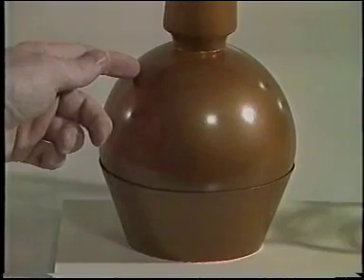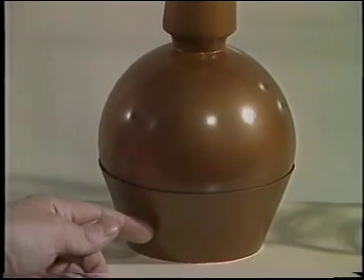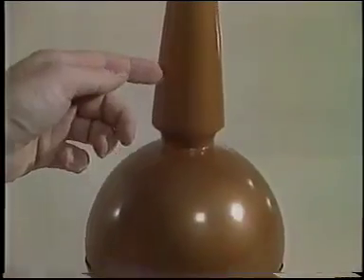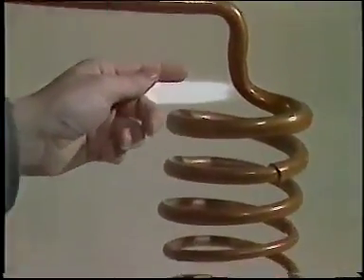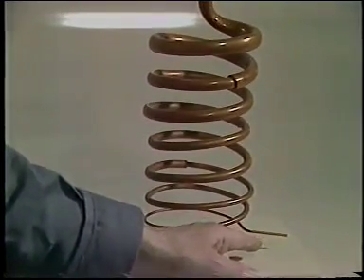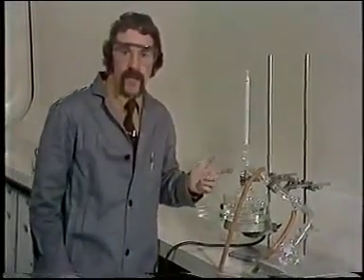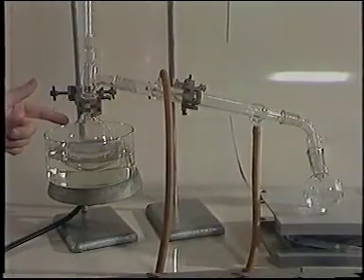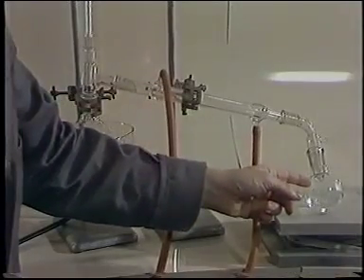We have a distillation vessel, a source of heat, which at Rosebank is steam, and the takeoff leads the vapors into the condensing system and to the outlet where the condensed liquid can be collected. The lab apparatus is very similar. We have a distillation flask, a condenser, and a receiver.